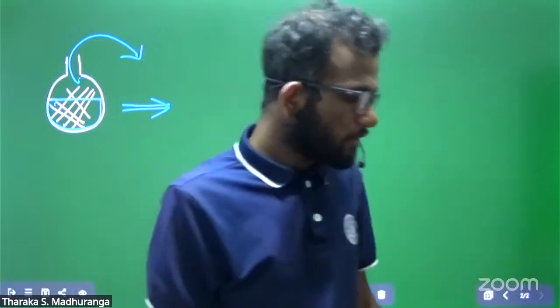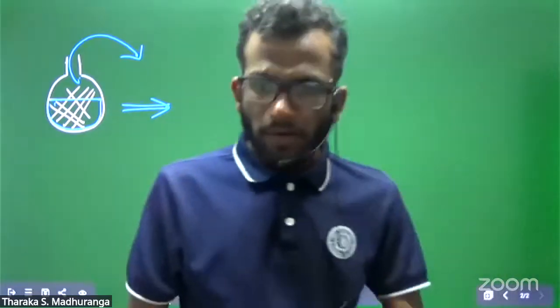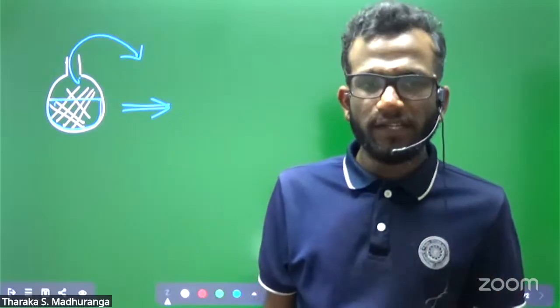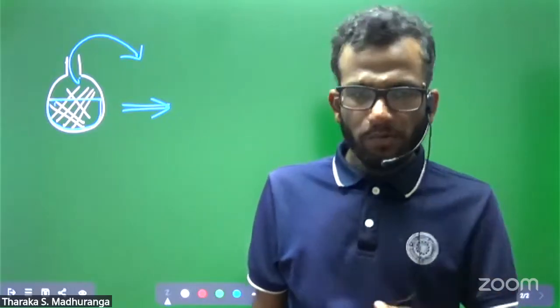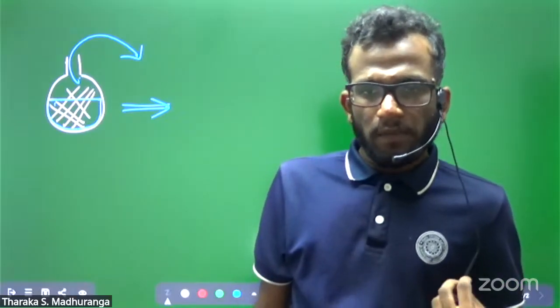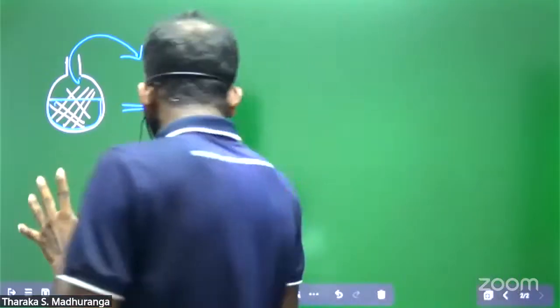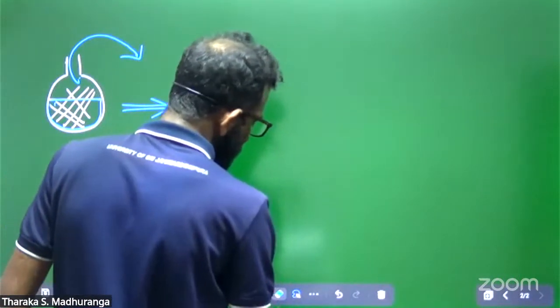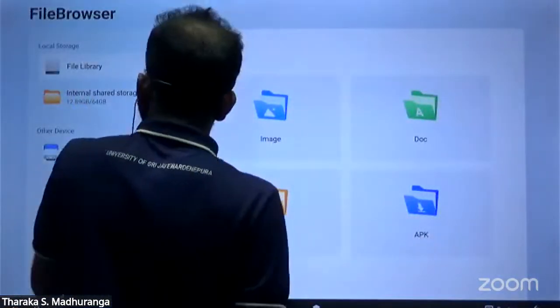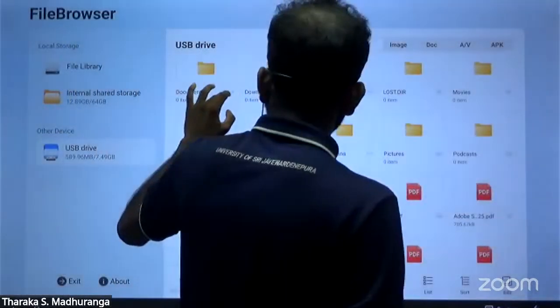Still we are discussing last day's lesson. Today I want to show you some practical. That is Soxhlet extraction. In the Soxhlet extraction, do you remember how to do Soxhlet extraction?